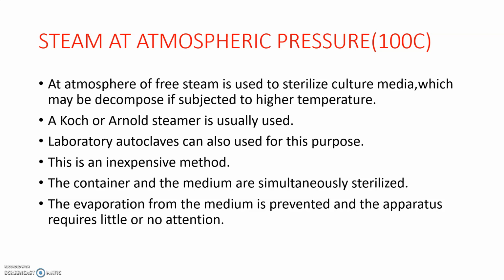Then next method is, so we have discussed boiling at 100 degrees Celsius. Next is applying steam at atmospheric pressure, or 100 degrees Celsius. In this method, an atmosphere of free steam is used to sterilize culture media which can be decomposed if it is subjected to higher temperature.